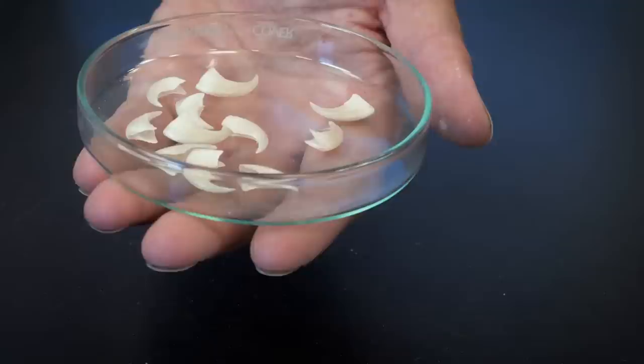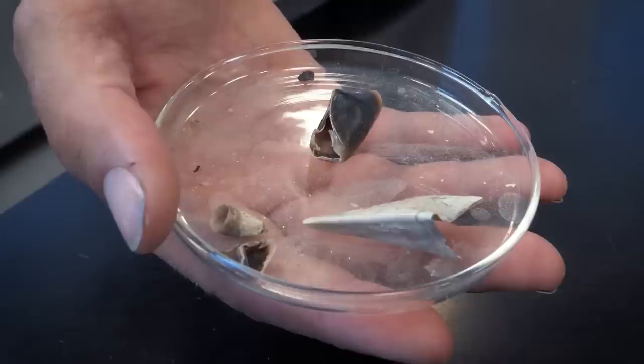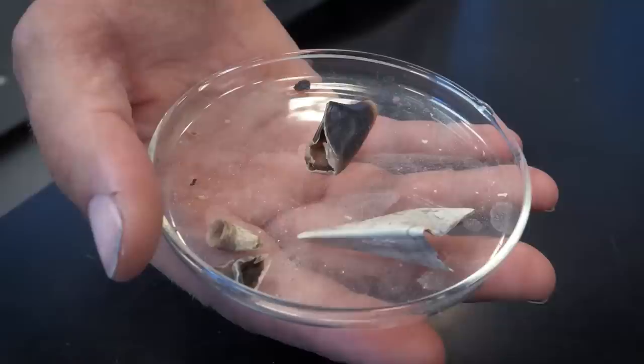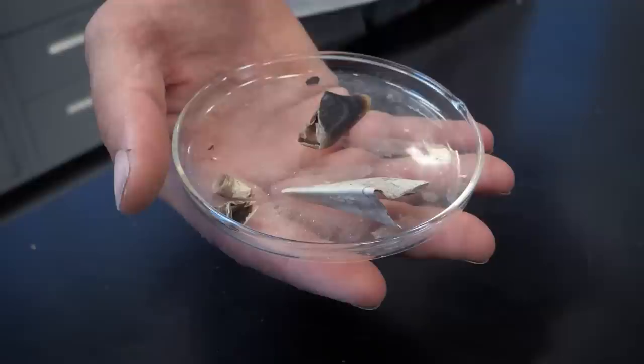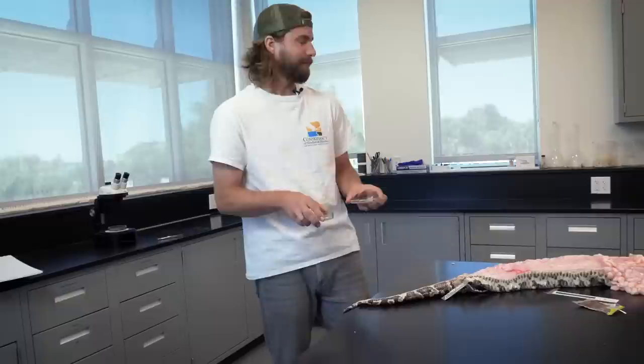Another thing that we keep finding in our really big snakes are hoof cores. The keratin in hair, feathers, and deer hooves doesn't digest as well, and that is essentially a deer fingernail. It's just a lot of evidence to suggest that these pythons are making a huge impact on the Western Everglades ecosystem.